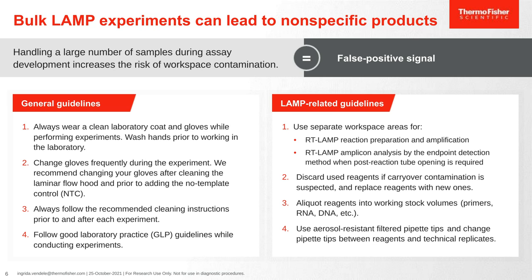Always follow the recommended cleaning instructions prior and after each experiment as provided in the protocol or a user guide, and just generally follow good laboratory practice guidelines. But when looking at LAMP-related guidelines, I'd like to specifically highlight that using separate workspace areas for RT-LAMP reaction preparation and amplification from RT-LAMP amplicon analysis by endpoint detection, when post-reaction tube opening is required, is specifically important to avoid a false positive signal. Discard used reagents if you suspect a carryover contamination and replace with fresh ones.